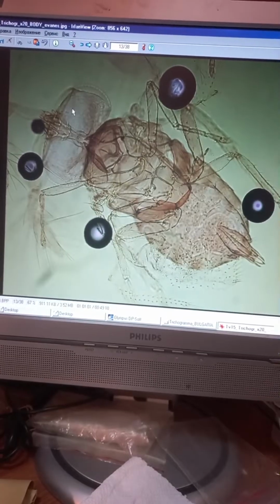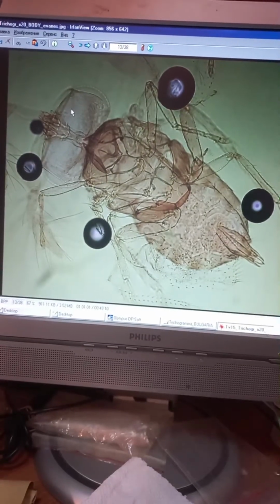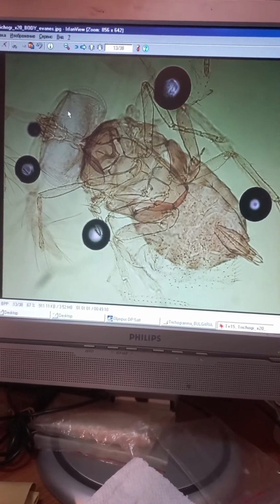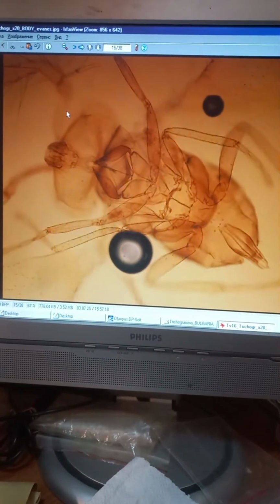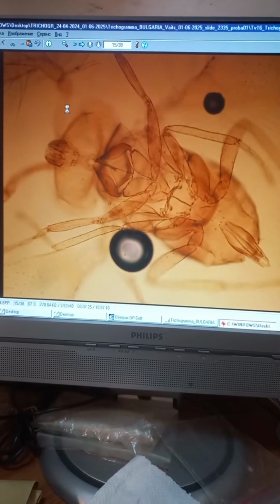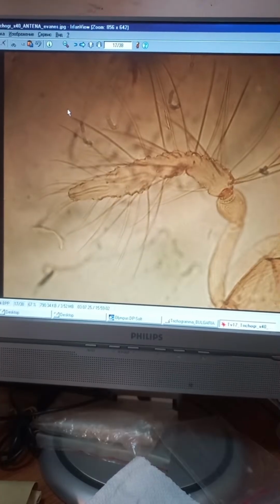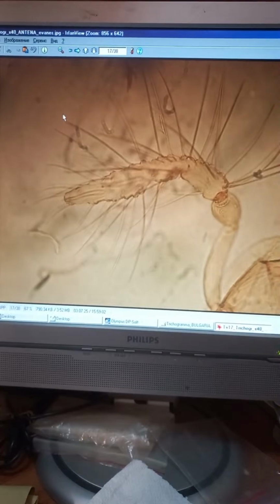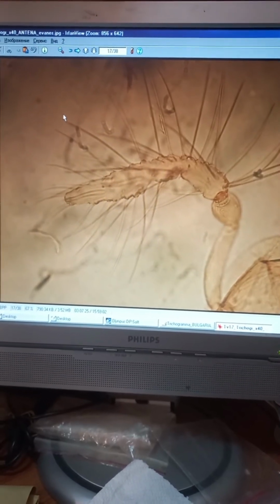The body, Trichogramma evanescens. So with some bubbles, it happens. Size of body 0.5 millimeter. Trichogramma evanescens, male. Very long setae of Trichogramma evanescens in comparison with Trichogramma achaeae. In achaeae, setae are very short.